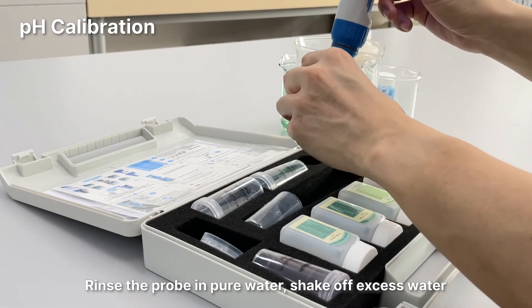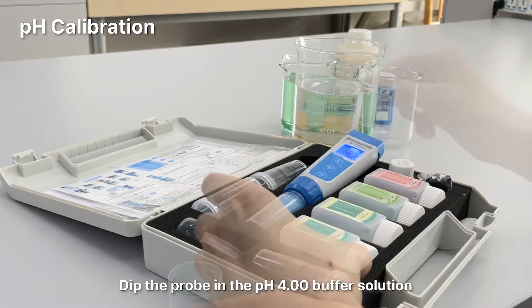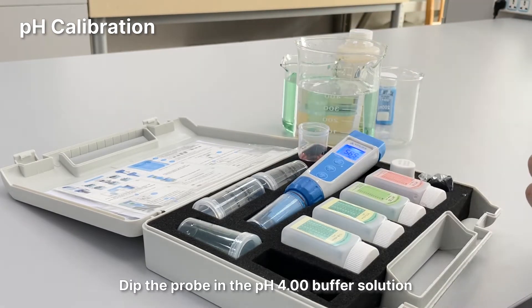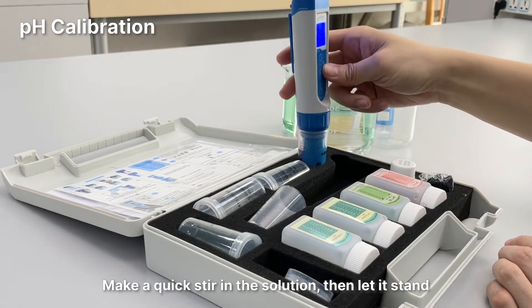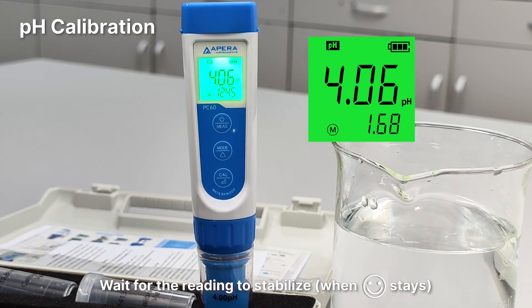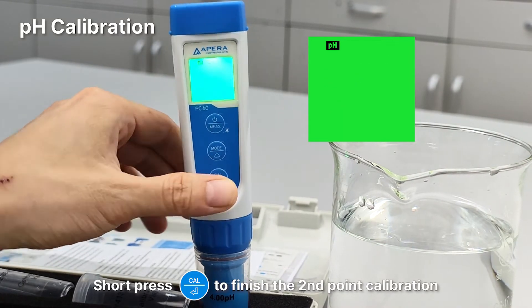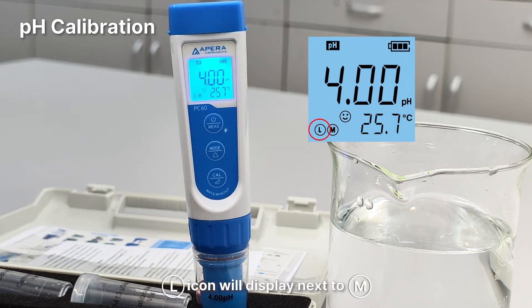Rinse the probe in pure water and shake off excess water. Dip the probe into the pH 4 buffer solution. Make a quick stir and let it stand. Long press the cal button to enter calibration mode. When the smiley face stays on, short press the cal button to finish the second point calibration. After calibration is completed, the tester returns to measurement mode. The L icon will show up next to M, indicating a successful two-point calibration.